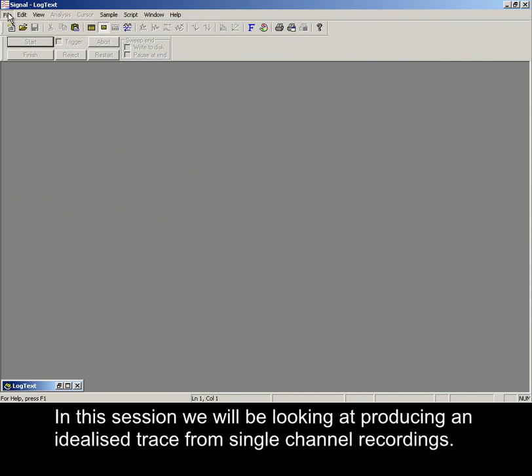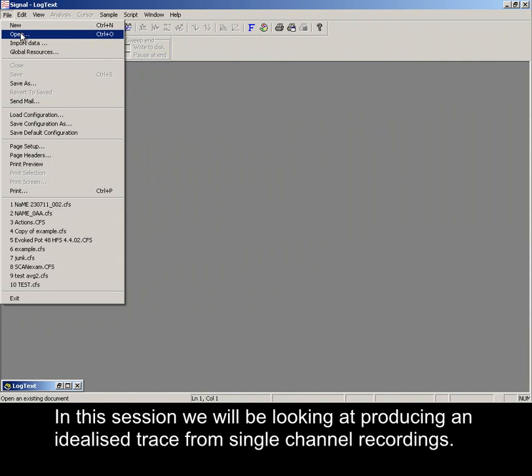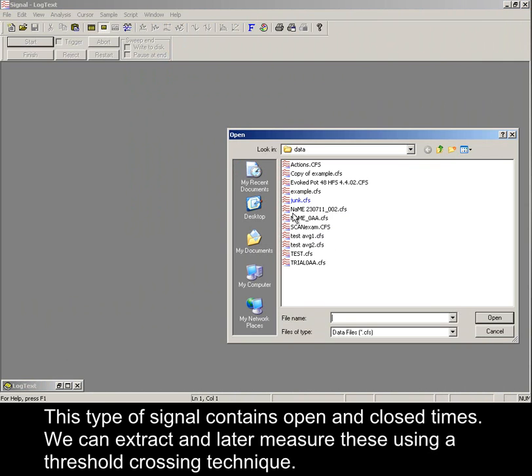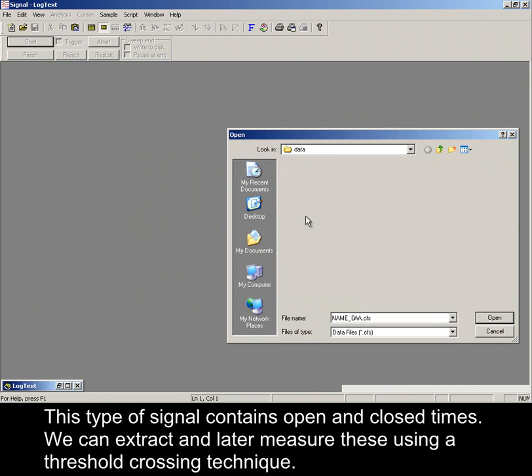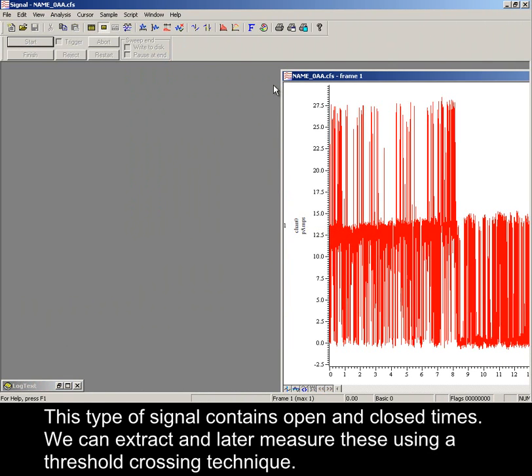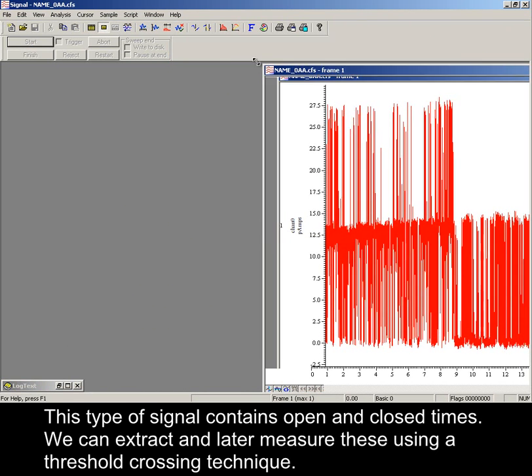In this session, we will be looking at producing an idealized trace from single channel recordings. This type of signal contains open and closed times. We can extract and later measure these using a threshold crossing technique.